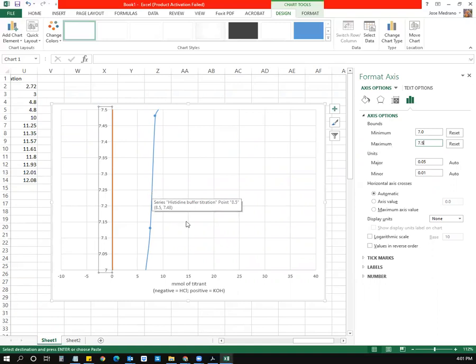But what about the x-axis? I want to get as precise an approximation as possible. That's kind of an oxymoron because you're either approximating or you're being precise, but it's weird being both. I want to get as accurate a value as possible.